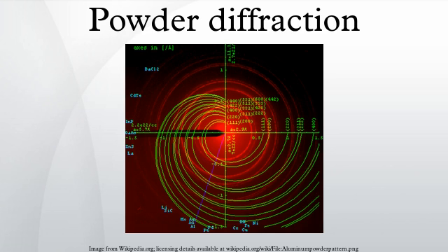crystal. This leads to the definition of the scattering vector as: in this equation, G is the reciprocal lattice vector, q is the length of the reciprocal lattice vector, k is the momentum transfer vector, θ is half of the scattering angle, and λ is the wavelength of the radiation.